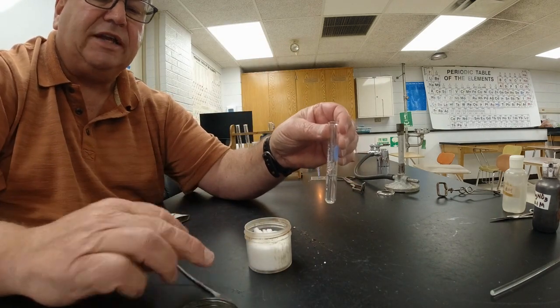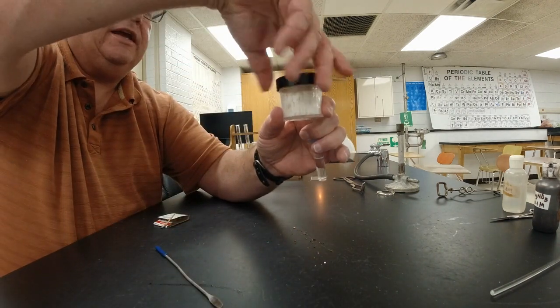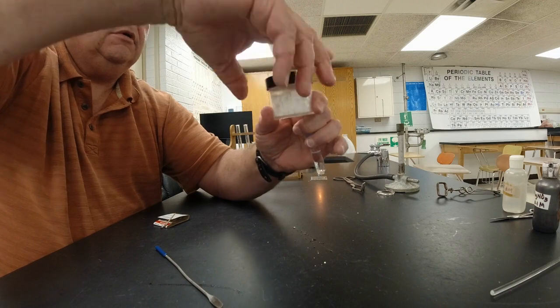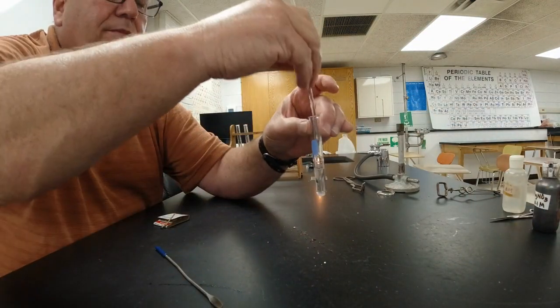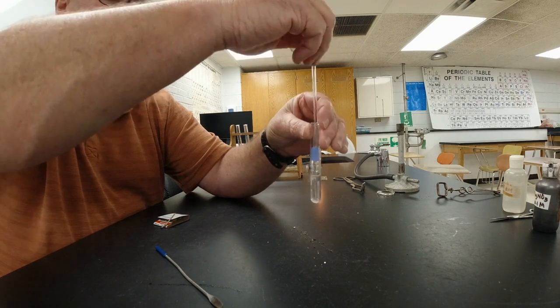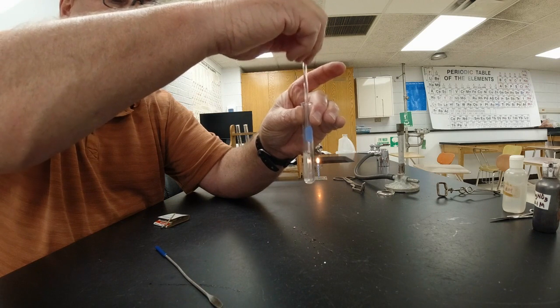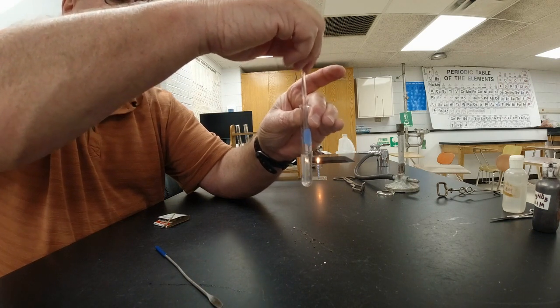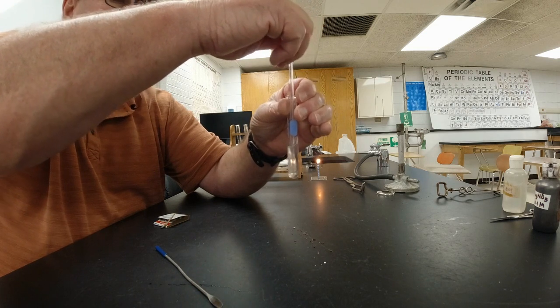Then you see it sink to the bottom like that, and we want to mix this thoroughly together. So I'm going to use a glass stirring rod to do that. And if I can get all the salt to the bottom and I stir it up really well, it takes maybe less than a minute.